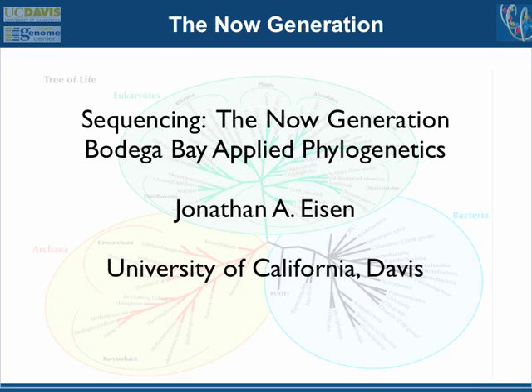Yeah, so normally for this class, I talk about what you would call phylogenomics, which is integrating evolutionary reconstructions and genome analysis in a variety of ways. And this year, they forbid me from talking about that. So what they wanted me to do, which I'm going to try to do, and please stop me anywhere along the way, is give you sort of an outline of sequencing methodology. And no one can keep up. I mean, there are like 20 new companies that are in the wings about to announce new sequencing technologies. You just have to follow the press to really stay along.